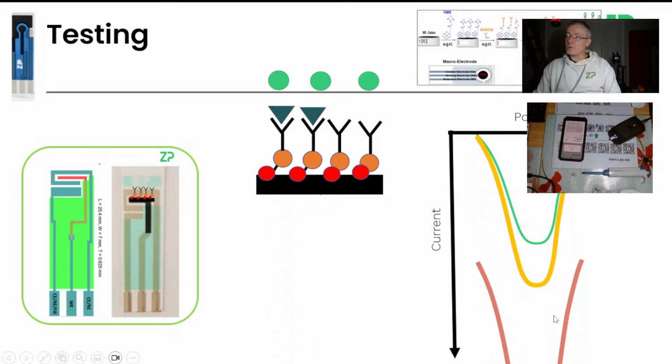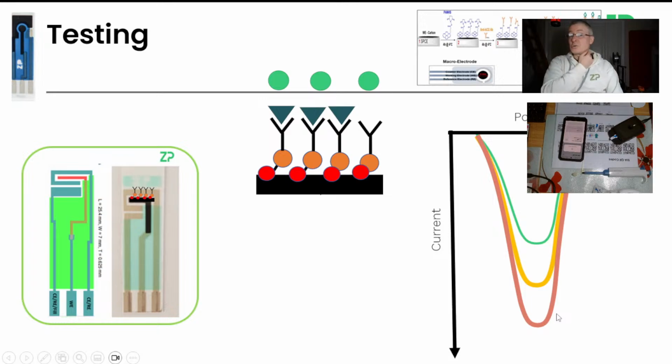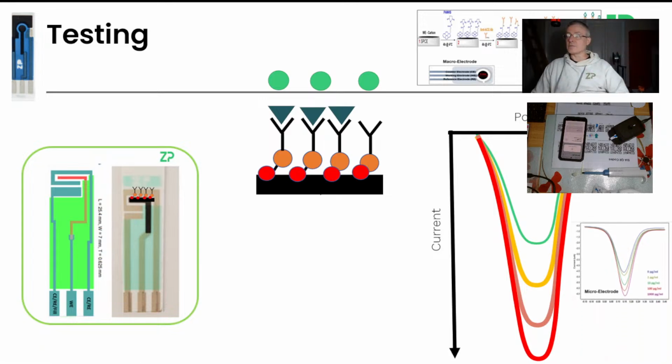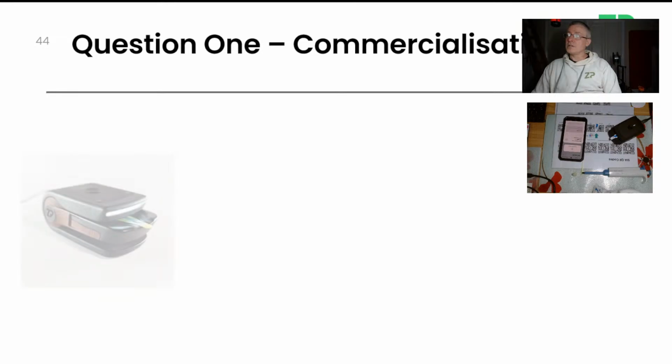You could ask me, why is that happening? Well, this was an unusual piece of work where actually we had an electrostatic repulsion, which got slightly neutralized in the binding. So even though we were increasing the steric hindrance, we were decreasing the electrostatic repulsion. In fact, we ended up getting more signal. Unusual. Earlier on in one of those MIPs papers, they would definitely do a blocking assay, and their signal decreased with binding, whereas actually it was a Ferritin paper. But in this one, actually the signal went up. So I apologize for getting that slightly out of order, but that was question number 12.